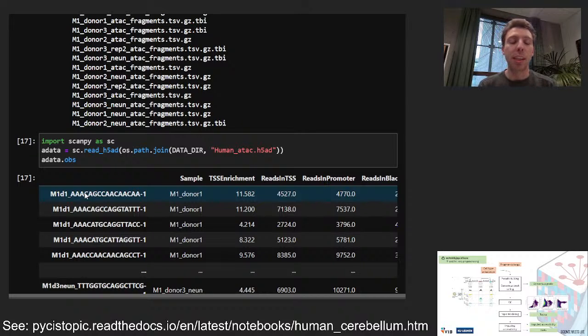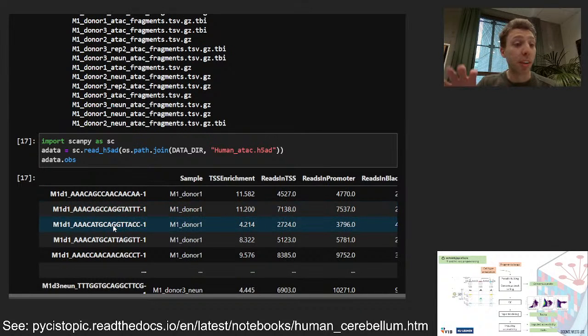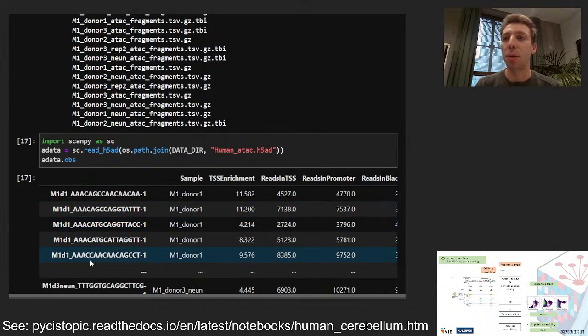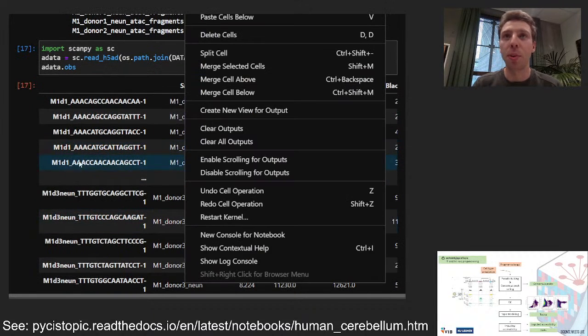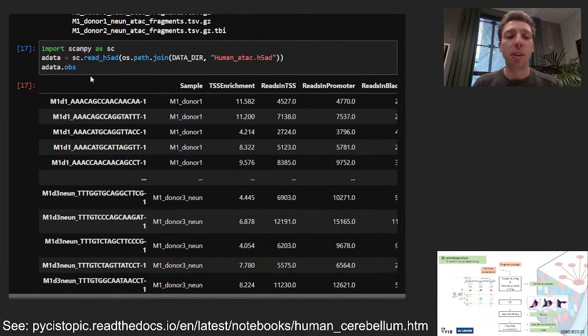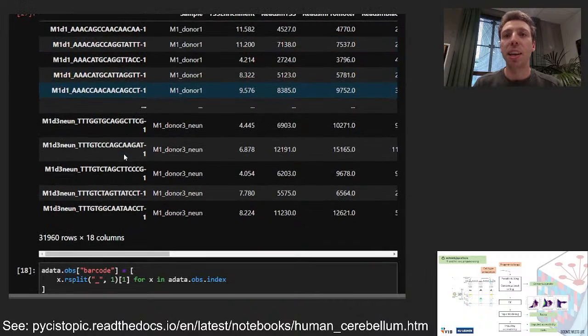If you have multiome data, you can start by analyzing the single cell RNA-seq side of the data using tools like Scanpy, where you perform clustering on the data and then call cell types. This is also what is done over here, but this is outside of the SCENIC+ space, as you can say. So this is done already. So we have an AnnData with some cell metadata.